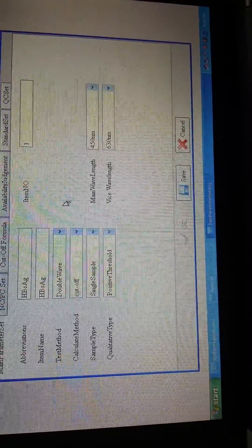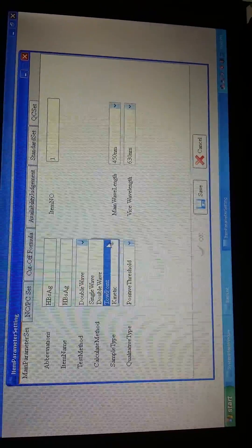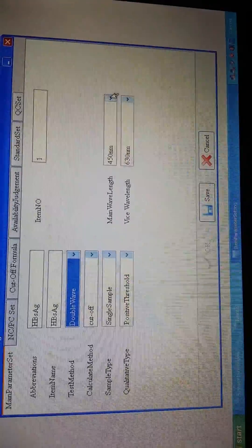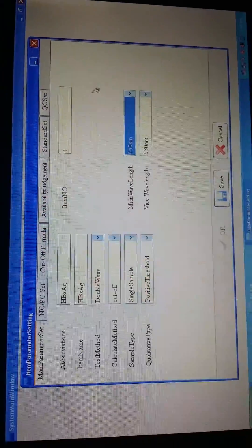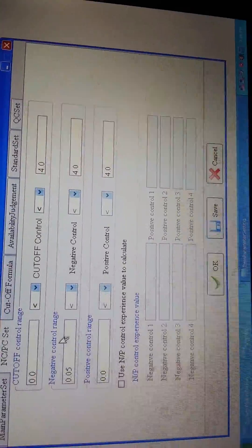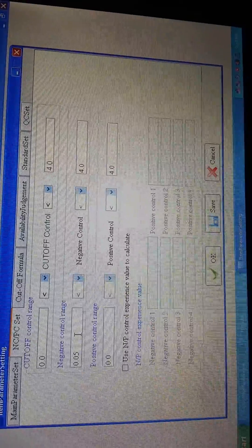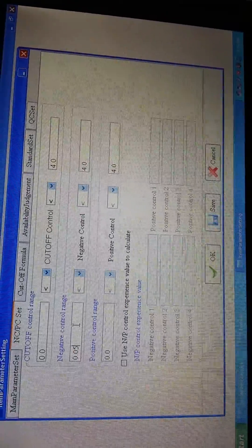This software will provide all the measures you have available. From here you choose the methods you want. Here are the wavelengths you will need — you just choose the wavelength, because the software also lists all available wavelengths. After you finish this, just save. Then are the PC settings — here you will set cutoff control ranges, negative control ranges, and positive control ranges. All numbers are also according to the reagent specification or reagent user manuals. After you do this, just save.